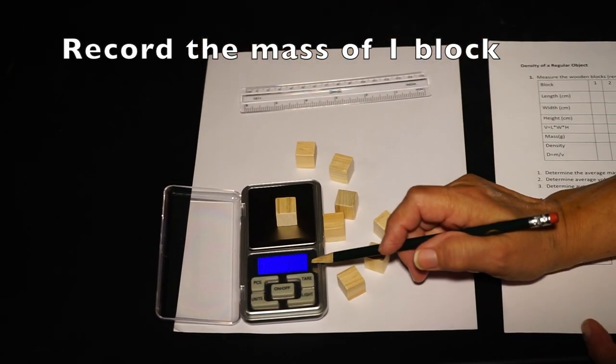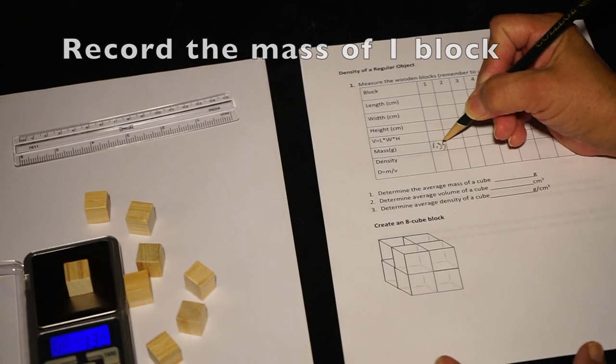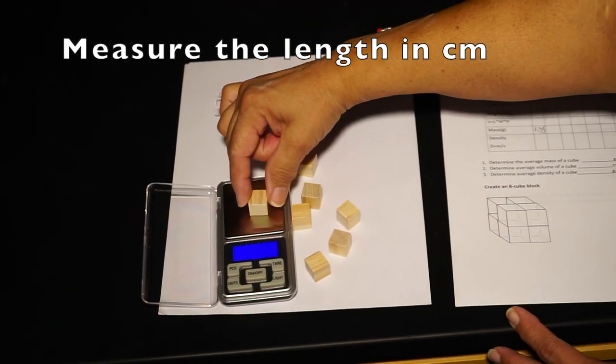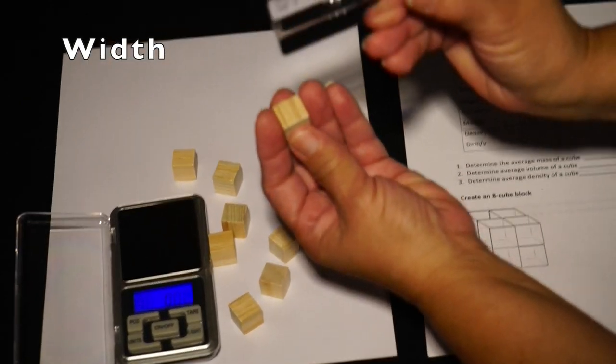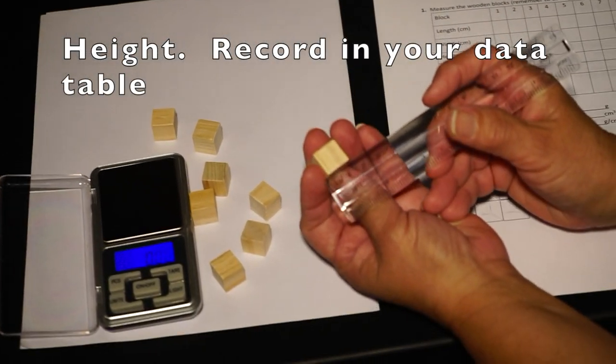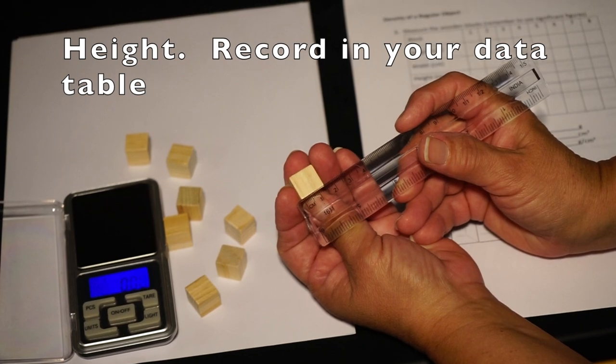Place one wooden block on the balance and record its mass in the data table. Next, using your ruler, measure the length in centimeters, then the width, and finally the height. Be sure to record these values in your data table.